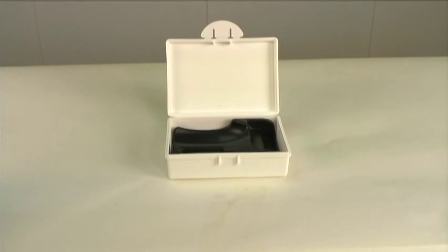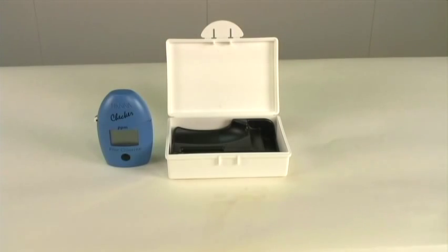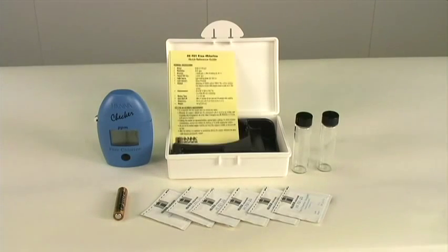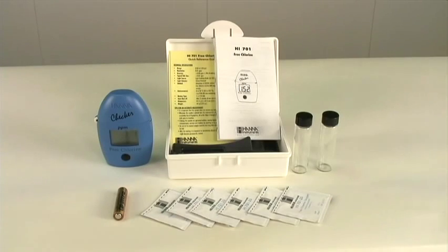What comes with the package is that you get the meter, battery, six chlorine DPD reagents, two cuvettes, a quick reference guide, and the manual, as well as a hardcover shell.